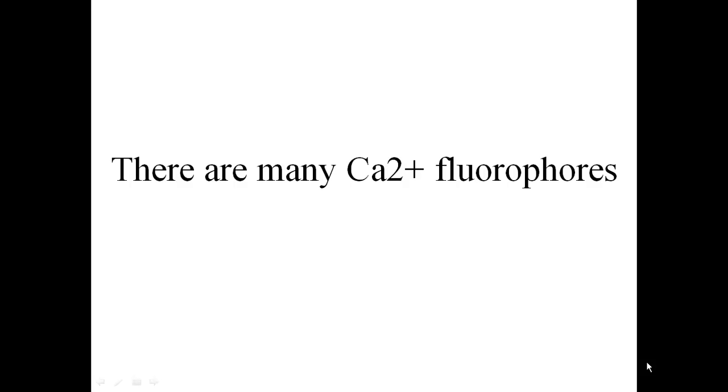There are many calcium fluorophores suitable for different purposes. Some are suitable for measuring calcium beneath the plasma membrane, some are suitable for measuring calcium in the endoplasmic reticulum, and some are suitable for measuring calcium in the mitochondria. It is likely that many more calcium fluorophores will be developed in future.